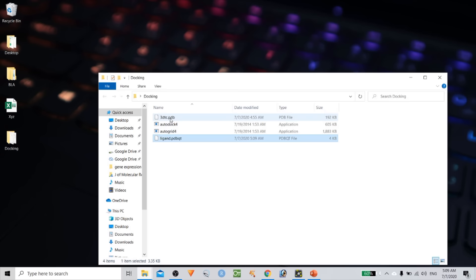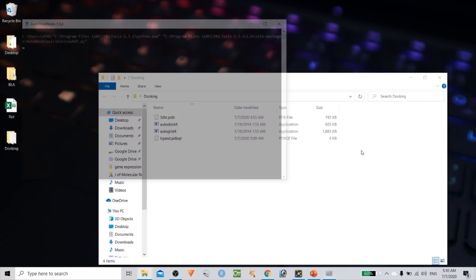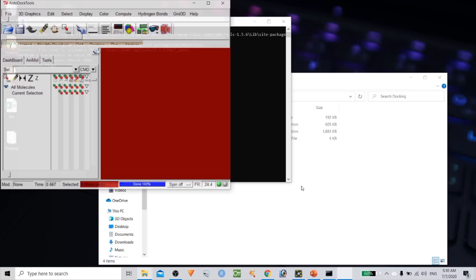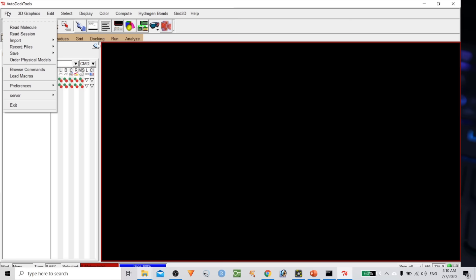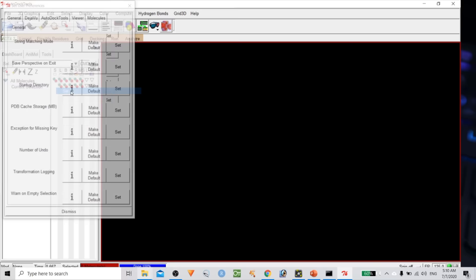Now you have two important files: the ligand file and the AutoDock executable files needed for docking analysis. Open AutoDock and set the path for the AutoDock tool folder — otherwise the program may produce errors. Go to File > Preferences > Set, copy the working space path, paste it, make it the default, and click Dismiss.